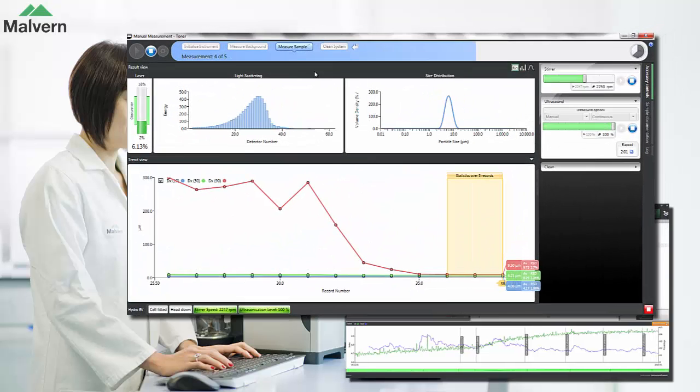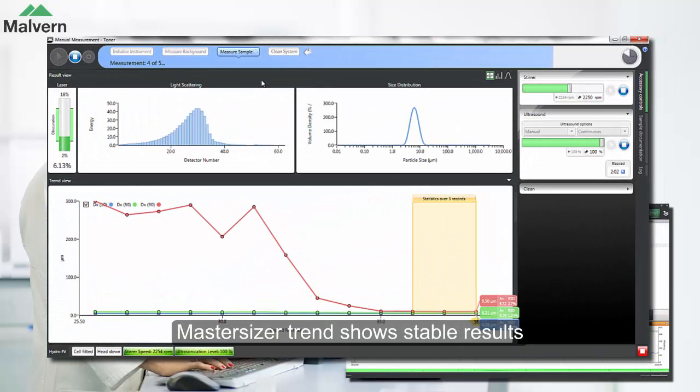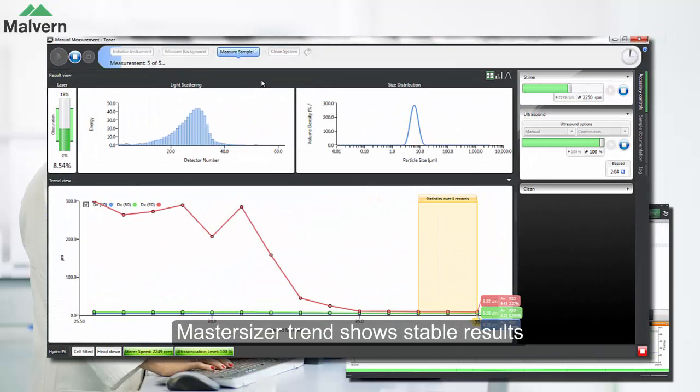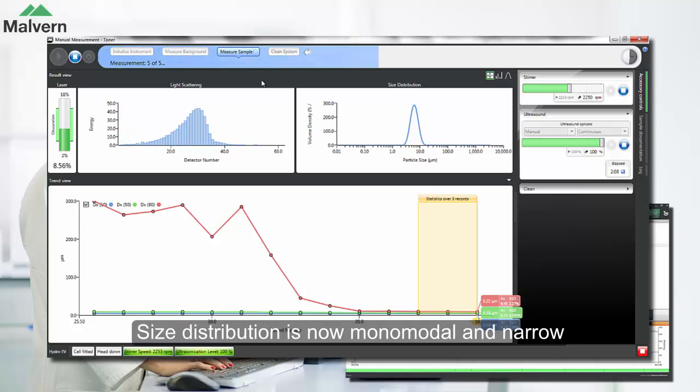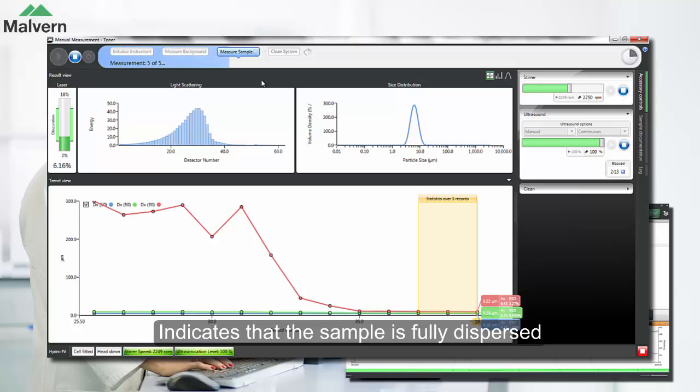If we look again at the MasterSizer software, the trend graph shows that the size is now stable, and the size distribution is now a single narrow mode, both of which suggest that the sample is fully dispersed.